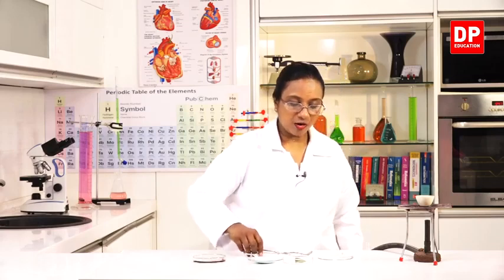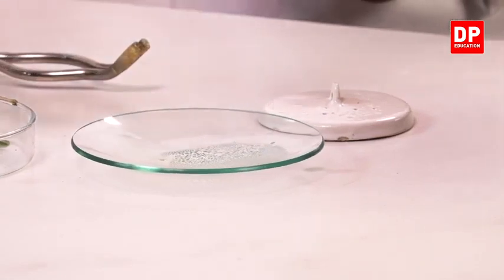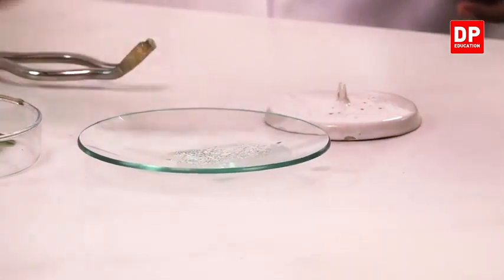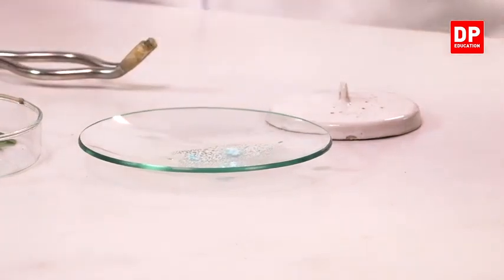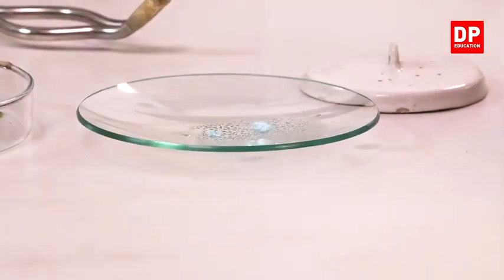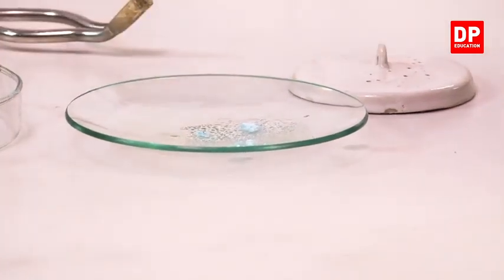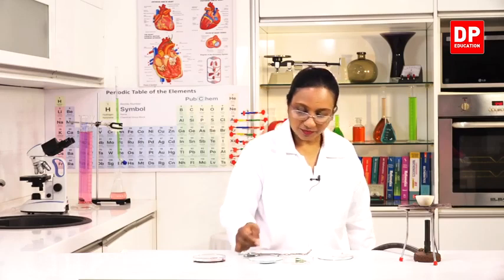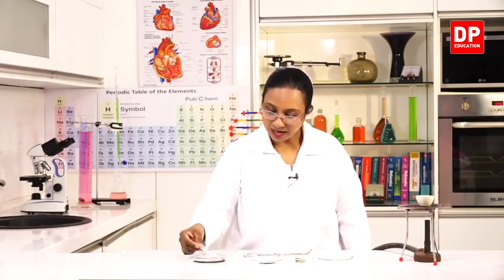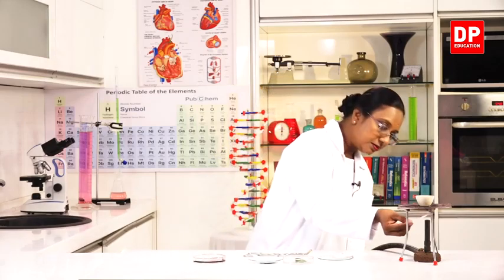You can clearly observe the droplets of liquid, and to that I will put copper sulfate. You can see the color changing. The light color of the copper sulfate, that is anhydrous, is turning to dark blue color. At the same time, I will dip a small piece of paper.